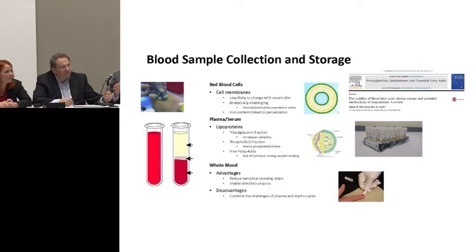Just a quick follow-up. Okay, please. Well, just to say that sometimes what we're really interested in is the degree of change. So even if you have one paper looking at blood spots and another looking at RBCs, there may be some utility in at least comparing the offsets due to a dietary intervention. I say that with caution. It's better to have the same method on the same GC, but there's maybe some latitude there to look at change. Obviously, looking at net endpoint numbers from different methods, you have to be careful about doing that.